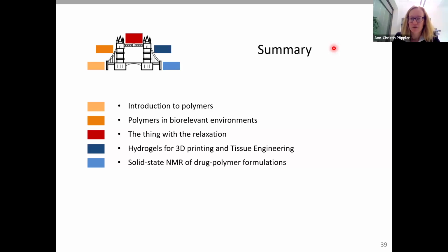And then we have a specific diffusion probe, which has a specific gradient, which is stronger than the one in the normal probe.